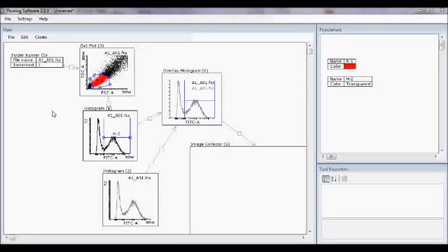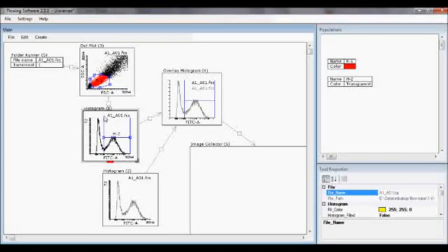The automation tools can be chained to make this automation more efficient. For instance, here I would like to have the pairwise overlay histograms. For instance, here always the A1, and here, for example, A2, something like this. And then next pair would be A3 versus A4, and so on.